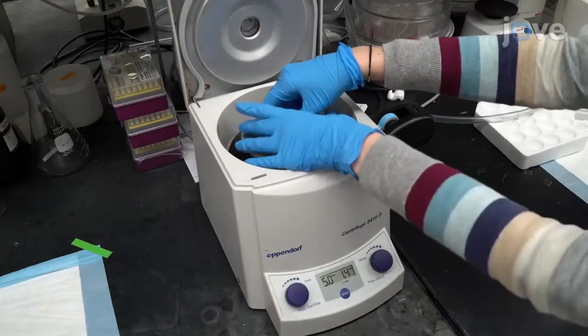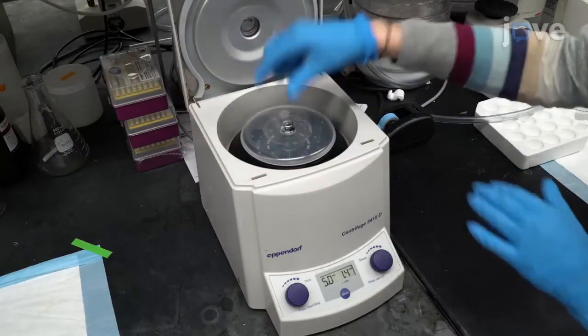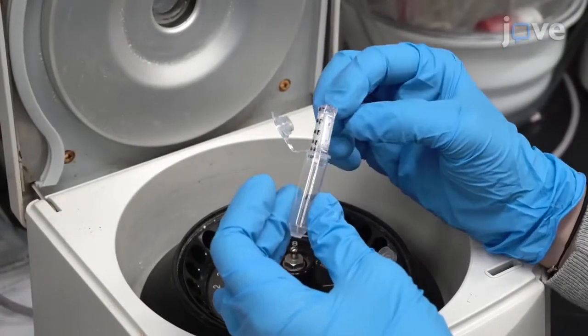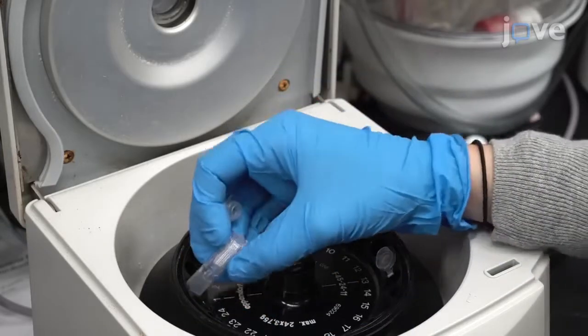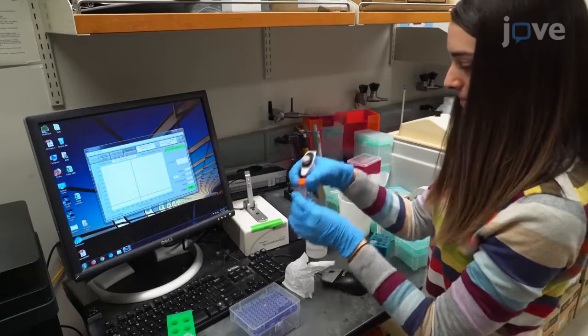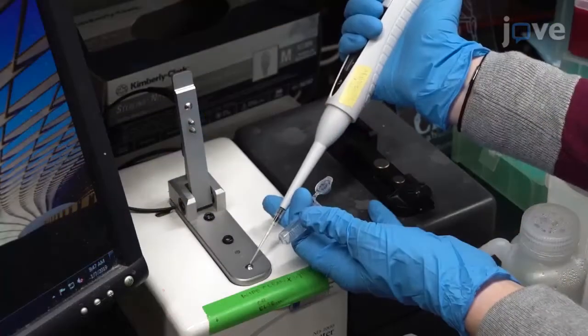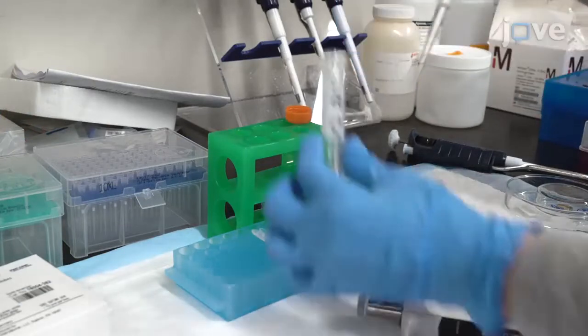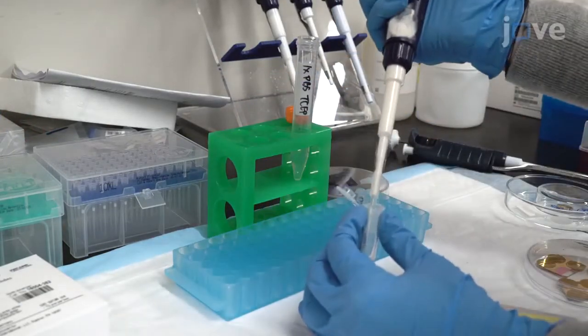Next, concentrate the purified polyprotein in a centrifugal filter. Then reverse the column and elute the protein into the buffer to be used in the experiment. Determine the appropriate protein concentration based on the absorbance at 280 nm, and then prepare 100 µL of a 100 µg per milliliter solution of the protein.